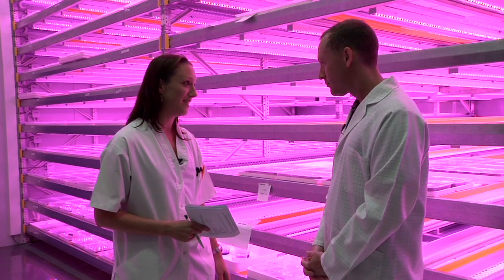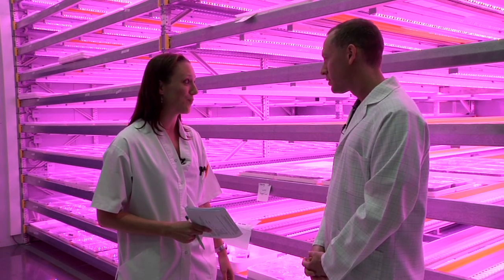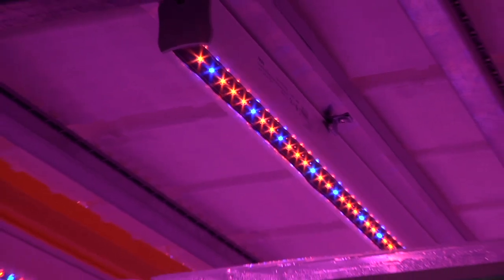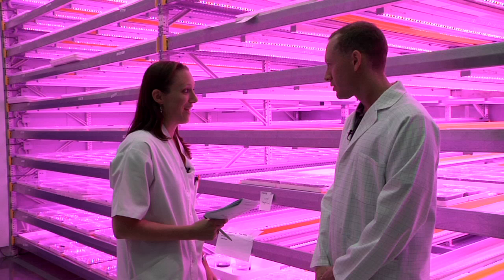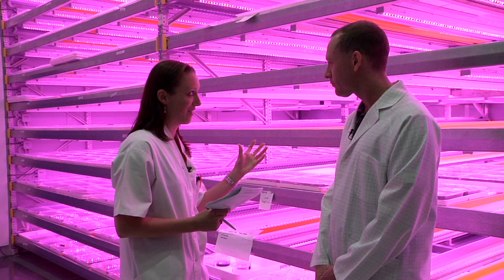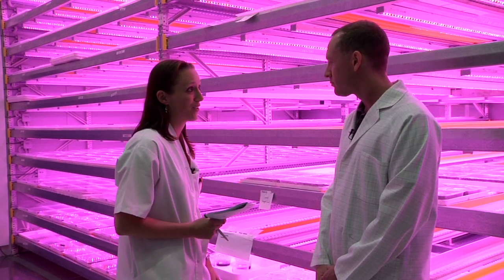We needed a higher intensity to harden our plants, so that's why we started to use LED lights. Together with Philips we tried five different light combinations, and after one year of testing we chose the best combination — the one where plants looked almost the same as plants from the greenhouse.